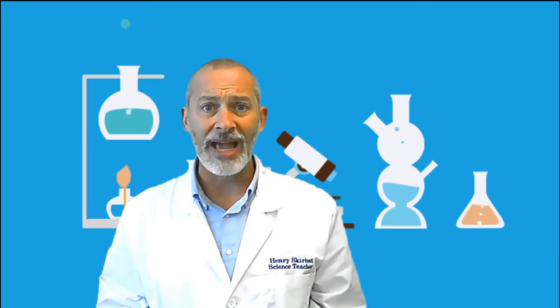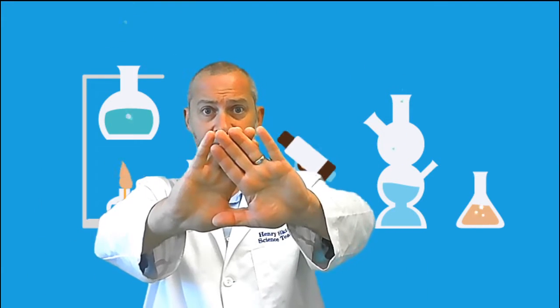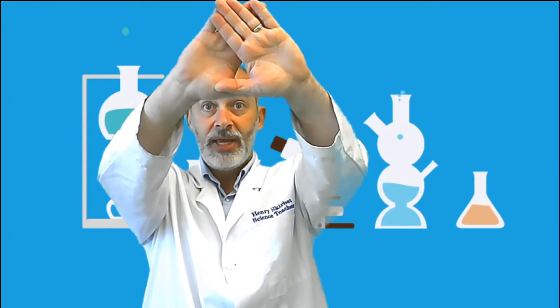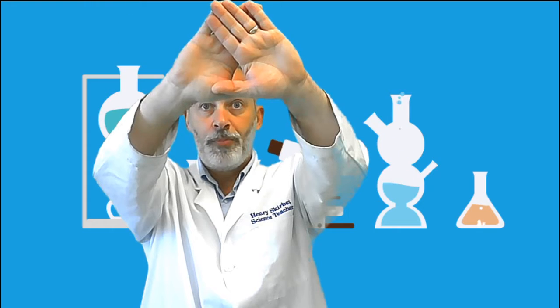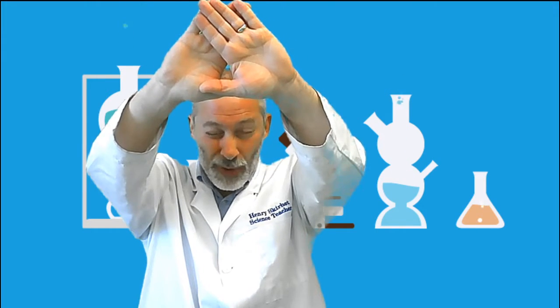Now, if that didn't work out too well for you, try it again. Make a triangle, arm's length away, okay? Keep the clock right in the middle, and here's another way of doing it. Keep the clock in the middle, blink your right eye. Open your right eye, blink your left eye. So you're blinking back and forth.